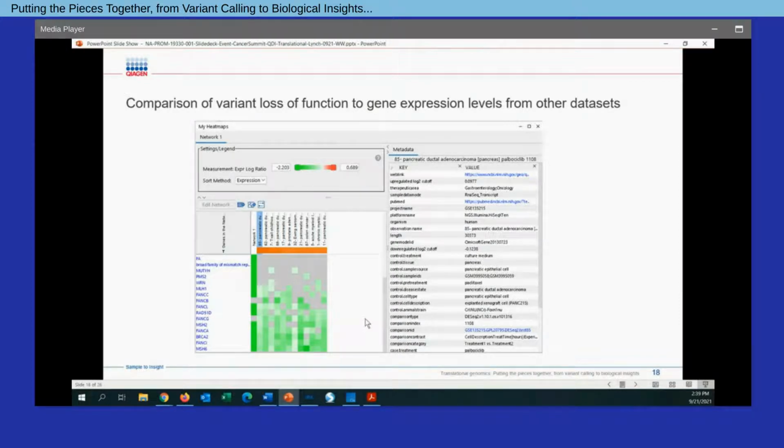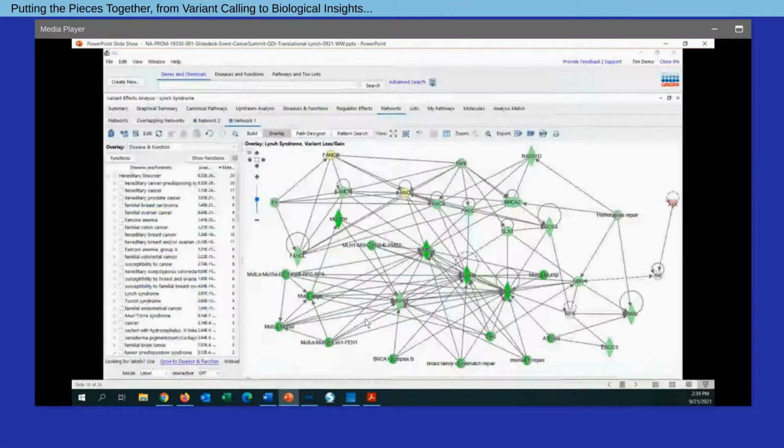So how we actually got to this point is that we utilize what we call the core analysis within Ingenuity Pathway Analysis. So much like Qiagen Clinical Insights Interpret Translational, Ingenuity Pathway Analysis relies on Qiagen's knowledge base, on a set of over 8 million findings, where our curation team has manually curated the literature to understand molecular interactions and associations, as well as the contextual details of those interactions and associations.